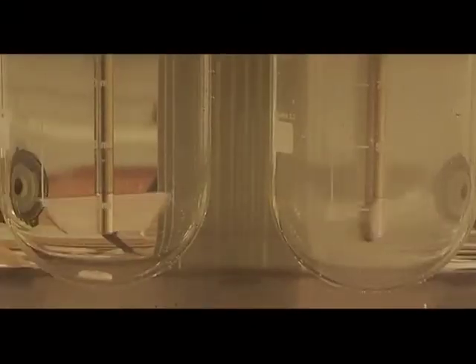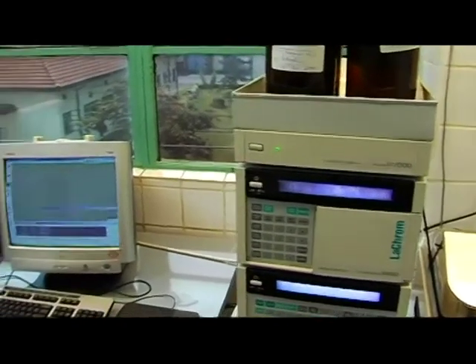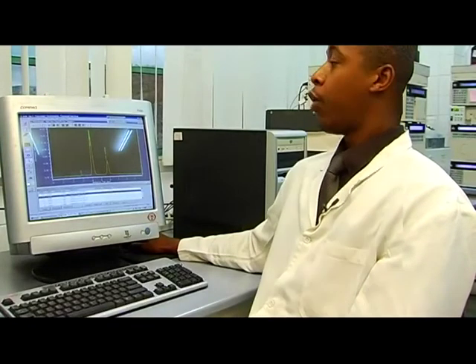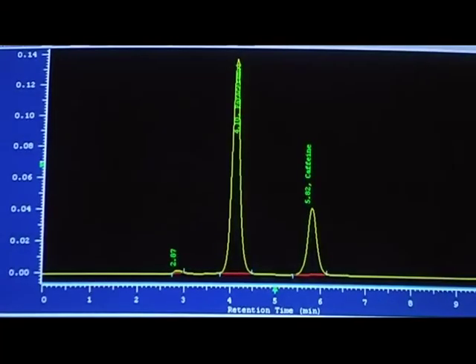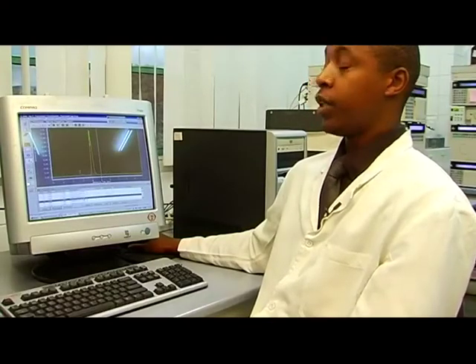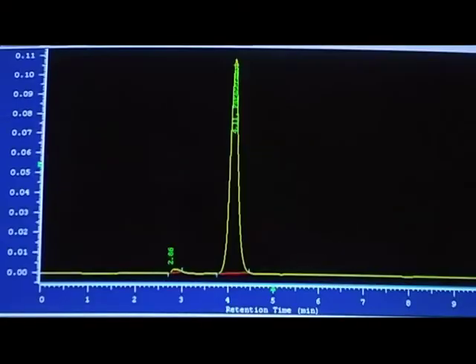One technique that we very commonly use here in the lab is high-performance liquid chromatography. It allows you just visually at a glance to very accurately have an idea of whether you're dealing with a counterfeit product or whether you're actually dealing with a product that is of good quality. A good quality product, like the one we've tested, would appear like this. You have 2 peaks, each representing the active ingredients. On the other hand, you had the substandard product, and you can see clearly here it has only 1 peak, meaning that it does not have one of the active ingredients.